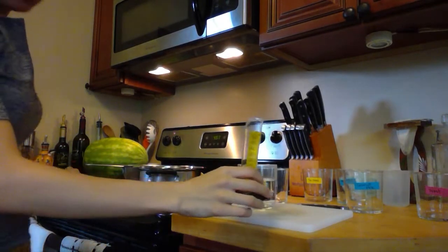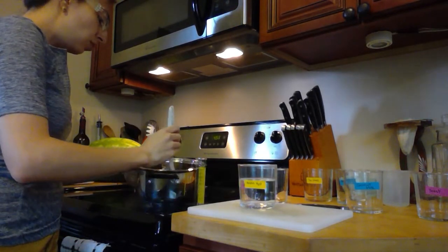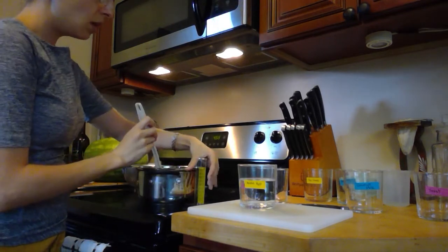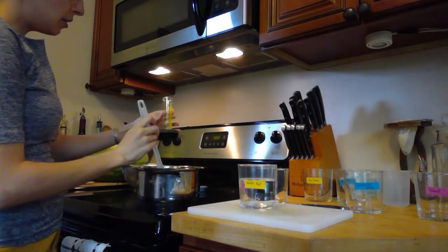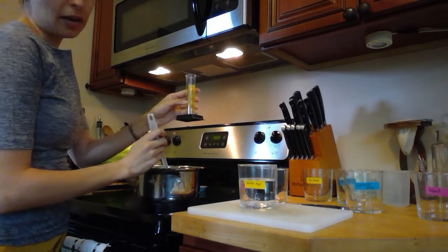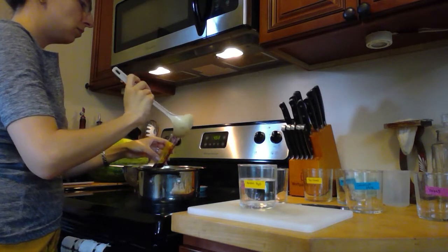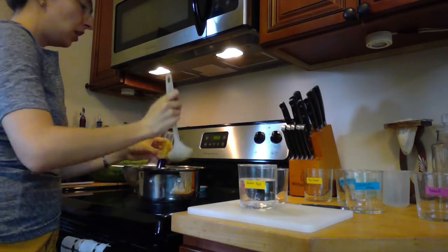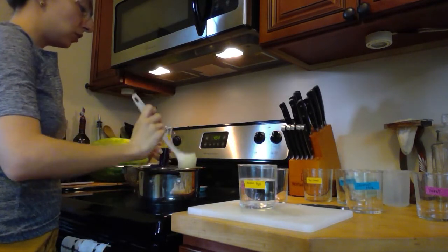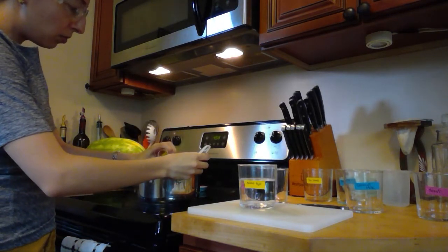Now, you might want a funnel for this. If you don't have one, maybe you use a spoon or a ladle. But however you do it, be very careful, again, not to spill, it might stain. And you want to get this up to the 25 milliliter line. And your liquid might still be a little hot, so just use caution. I went a little over, I'm going to pour a bit out.